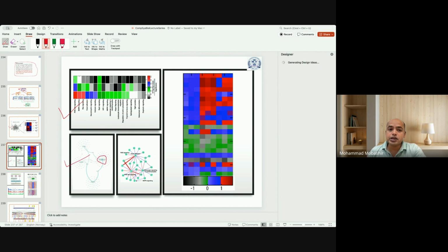These are the hub genes, or critical genes. In another way, you can say these are the genes which could act as master regulator genes in any condition. Then another way of pathway network level analysis is crosstalk, and you could see how to analyze this pathway crosstalk in my paper, which was published in Cells in 2022, in this journal, which is called GCIP software.